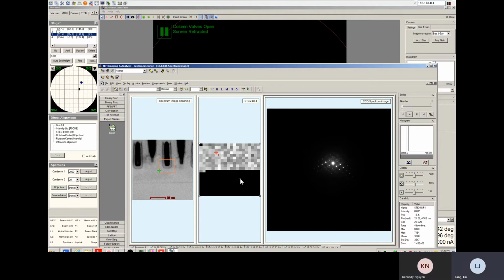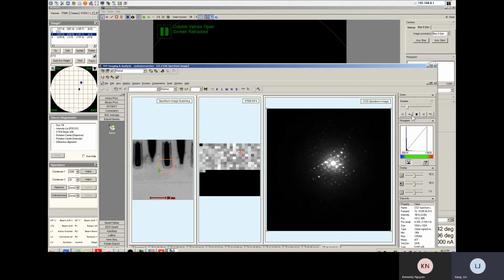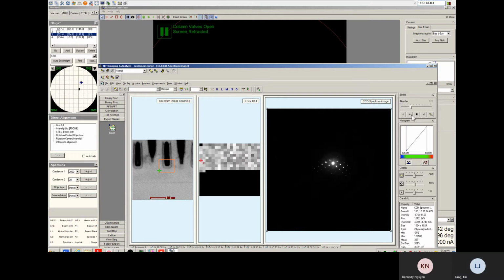You have different pixels. So you have multiple images here, but in the middle image you just have multiple pixels, corresponding to different pixels, right? So these are the numbers assigned to that pixel then. Okay. All right, cool.